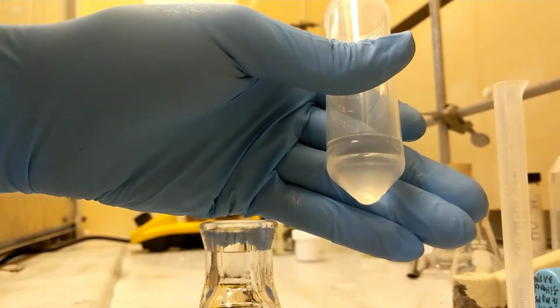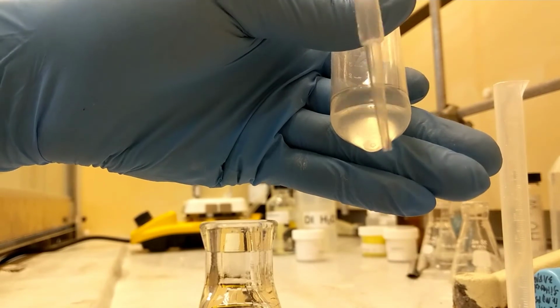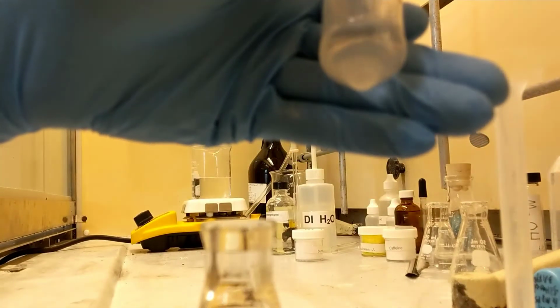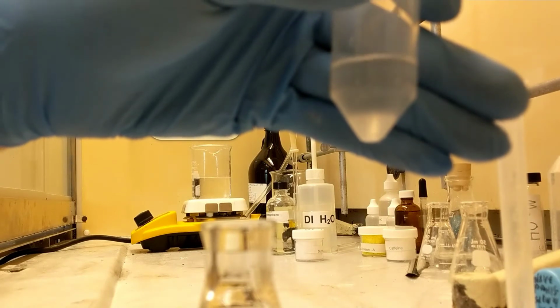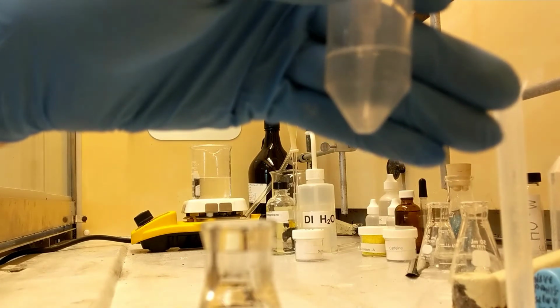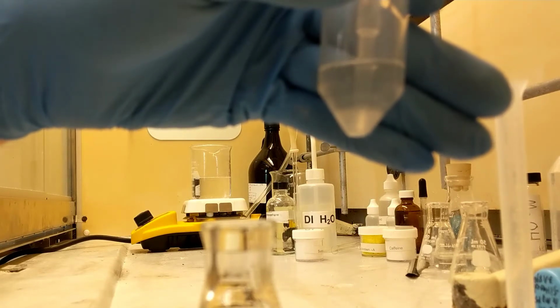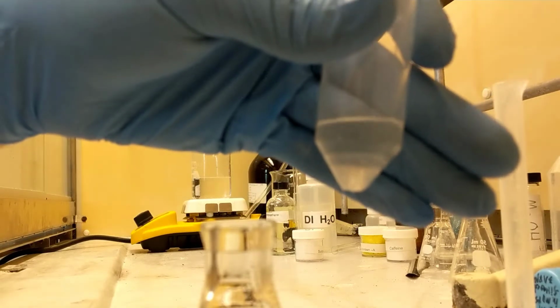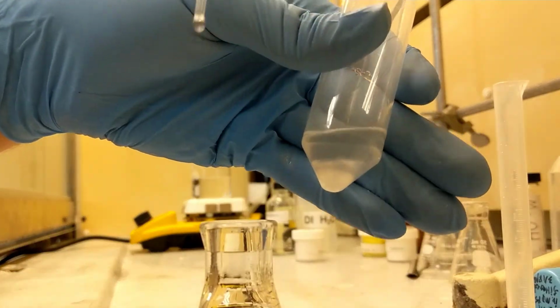Okay. To do this, I'm going to put my Pasteur pipette down in the bottom V, like that. First I'm going to release the air, and then I'm going to put it in the bottom V, and I'm just going to pull up that bottom layer. Boom.